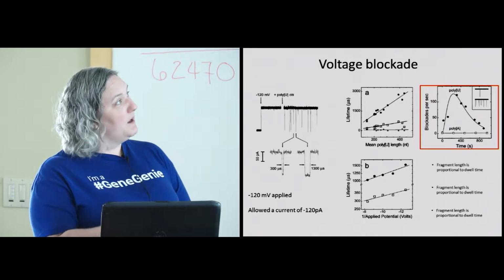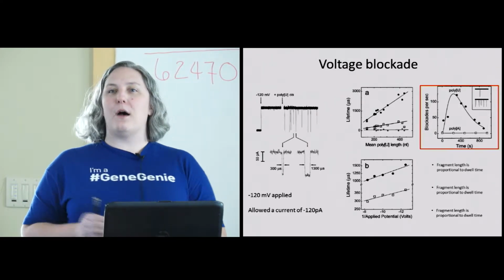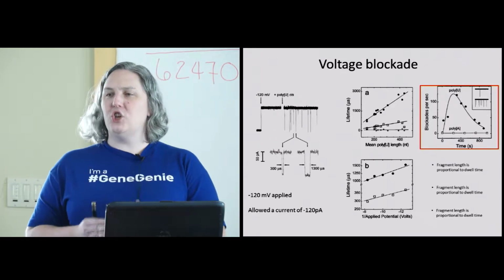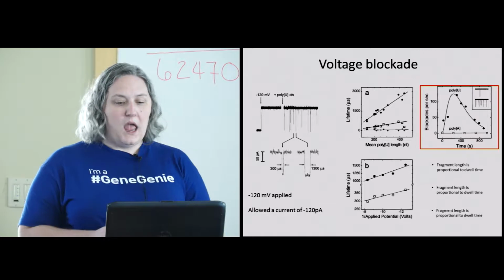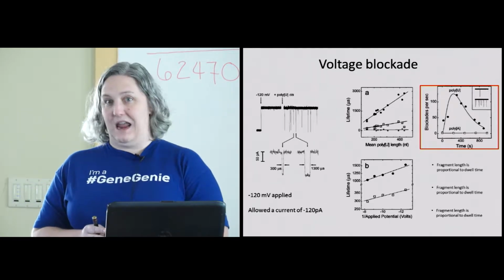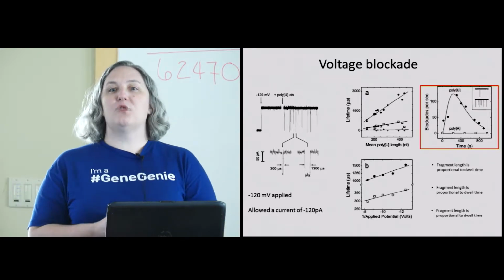So what they did here, to explain what this experiment was, they took a long 10,000 base pair poly-U fragment. This is produced synthetically, by the way. And then they added ribonuclease A to this. So the very, very large fragment does not translocate through the pore for diffusion reasons and structural reasons. It doesn't do anything. And that's at time point 0.